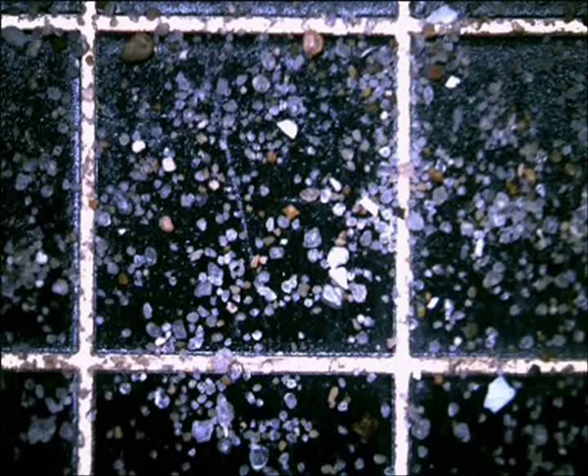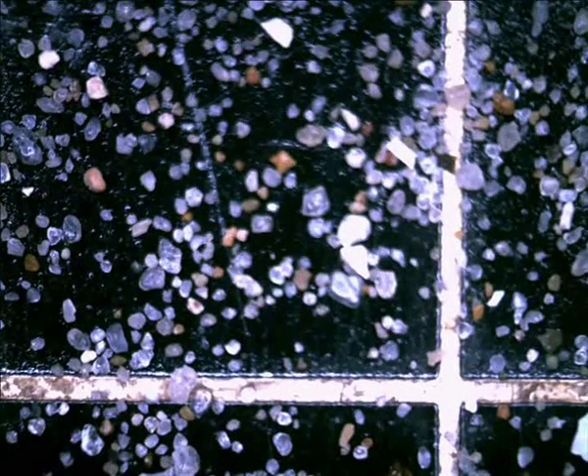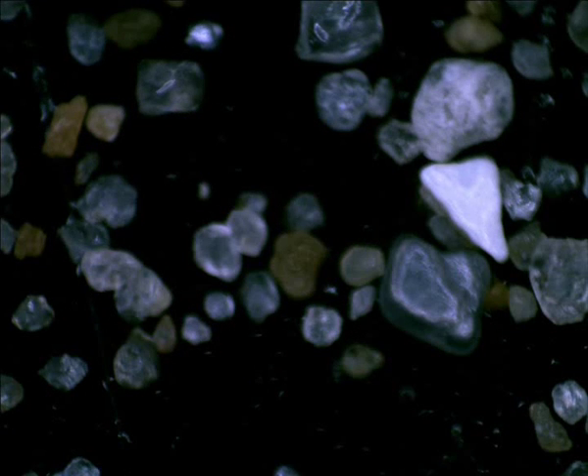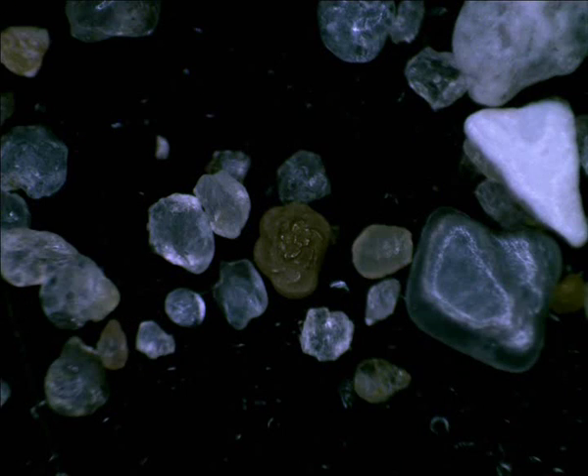The sample is now under the microscope and we are seeing one field — one centimeter by one centimeter. We don't see much, but it looks like a pretty Mediterranean beach sample with a lot of quartz. Of course we have to move in and look for some forams. We need sharpness and light.